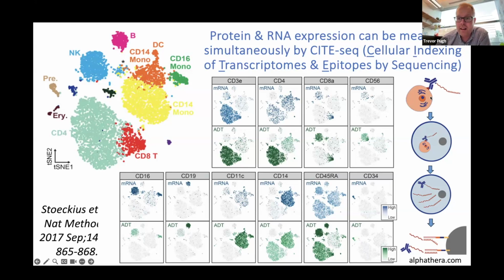So this has the added benefit that if the antibody is stuck, you actually can read it out using DNA sequencing. And that kind of filled in the gaps where you have a marker that you read by RNA, where sometimes you'll have spotty or almost no performance. If you look at the CD8 marker, it really shines through using a protein-based marker as well. And that's really the state of the art of genomics in general, is now these multi-omic approaches, not just in single cell, but also conventional cancer genomics and cell-free DNA have really started to pursue not just DNA approaches, but other orthogonal approaches like protein to boost your signal.